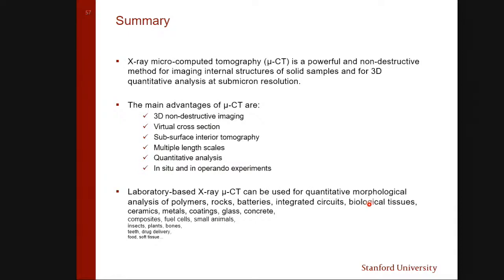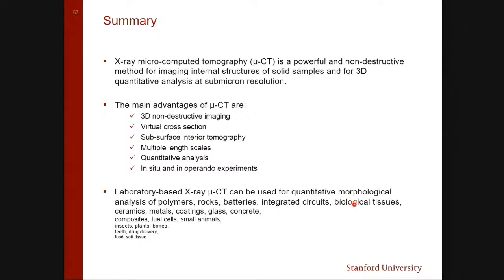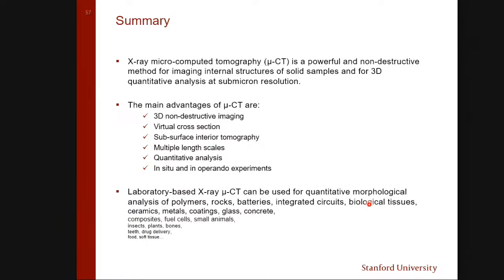Concrete, we can do concrete as well, because our instrument works from 30 kV up to 160 kV. When you go to 160 kV, you can penetrate through something like 2-inch rock. Or you reduce to 30 kV, then you can work on light materials. So generally, think of a subject which you would like to look inside but don't want to destroy, then CT is good for you, okay?